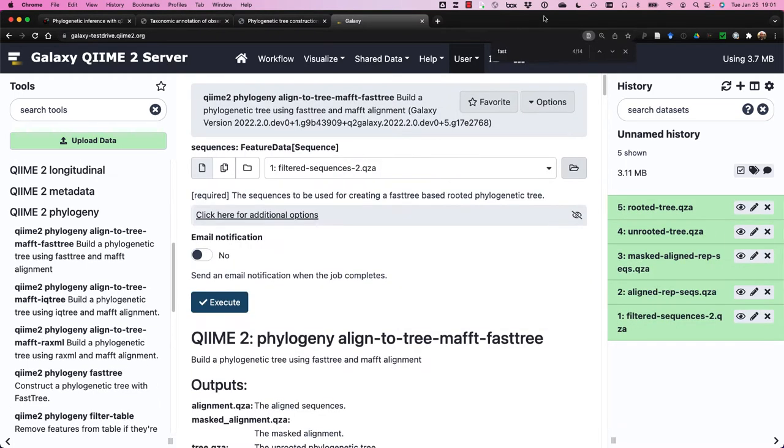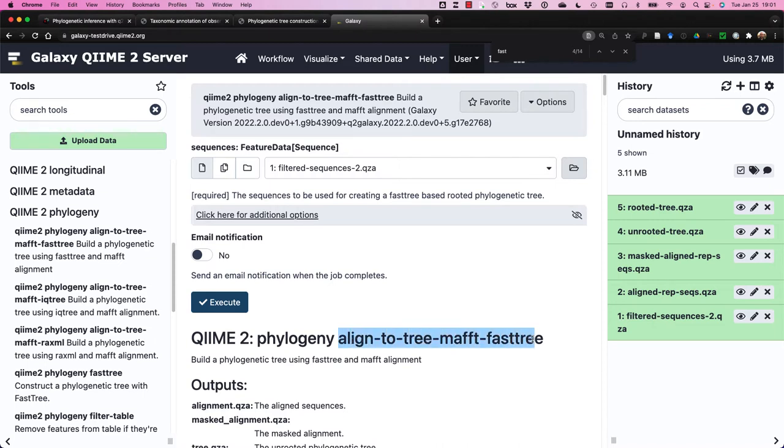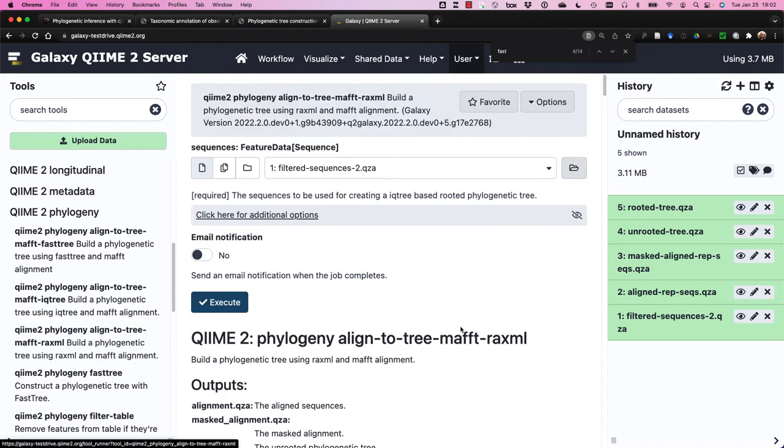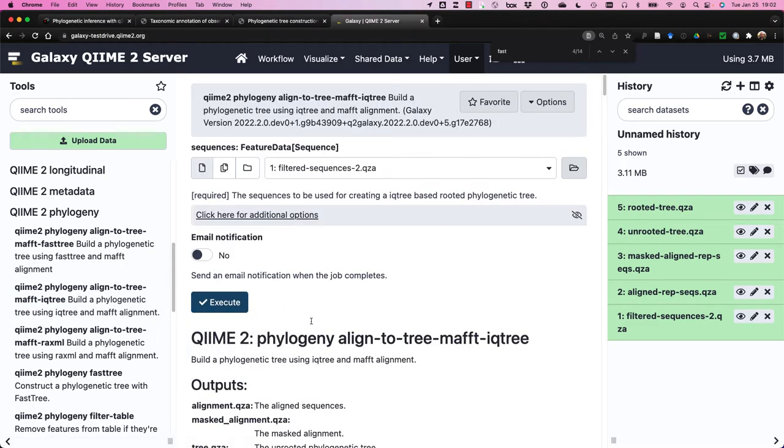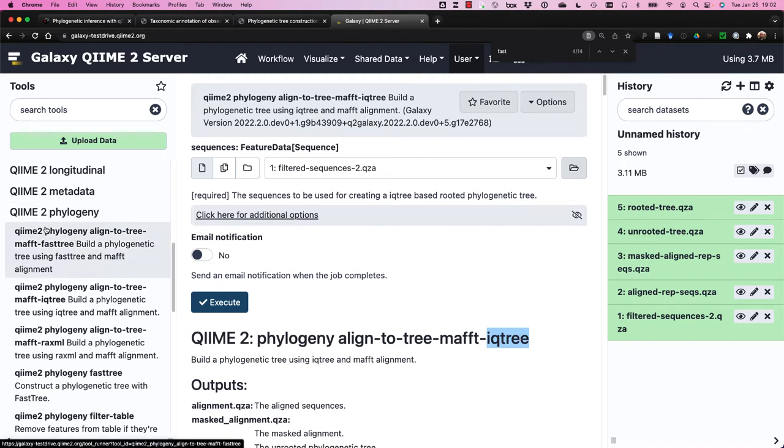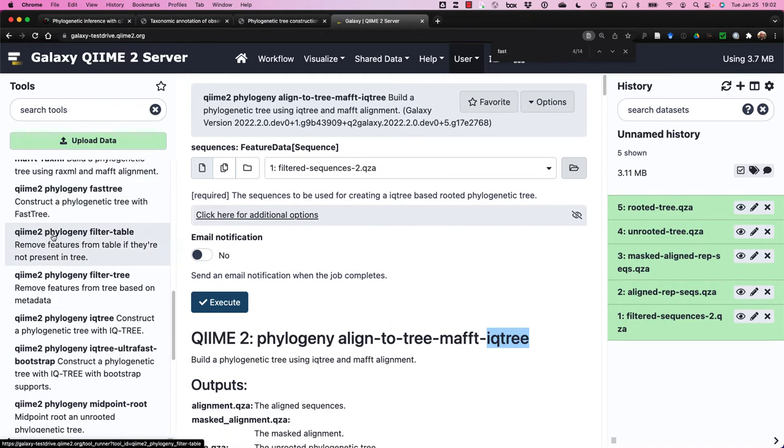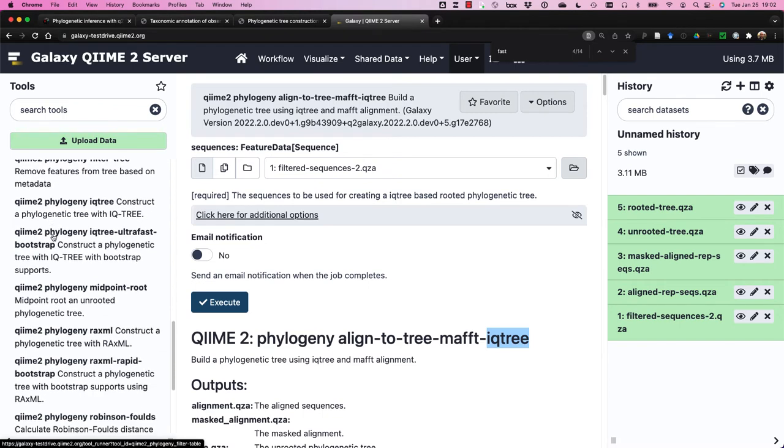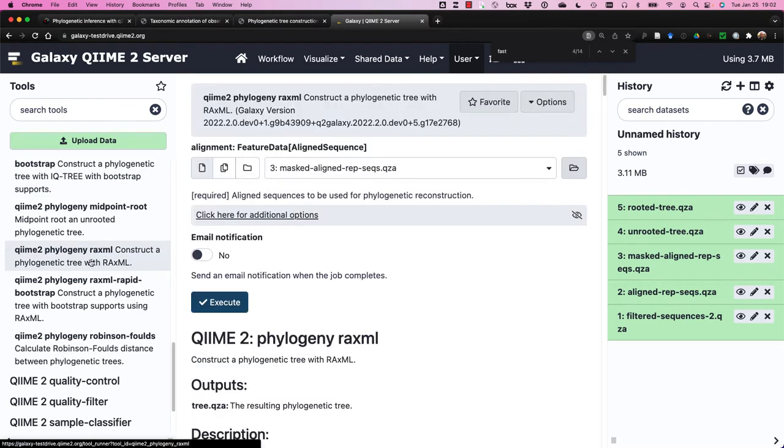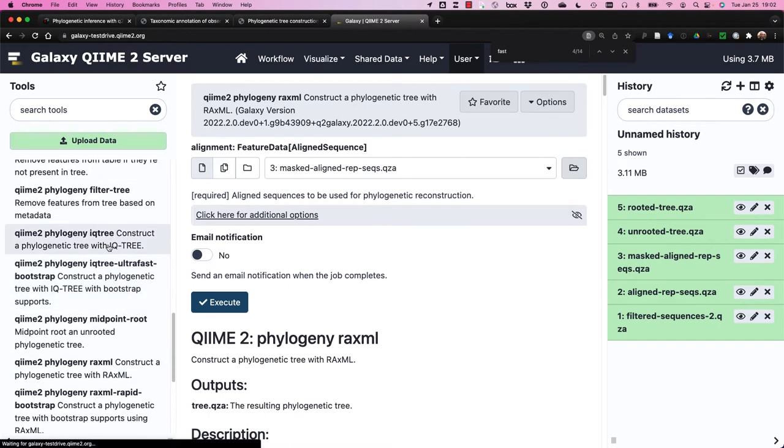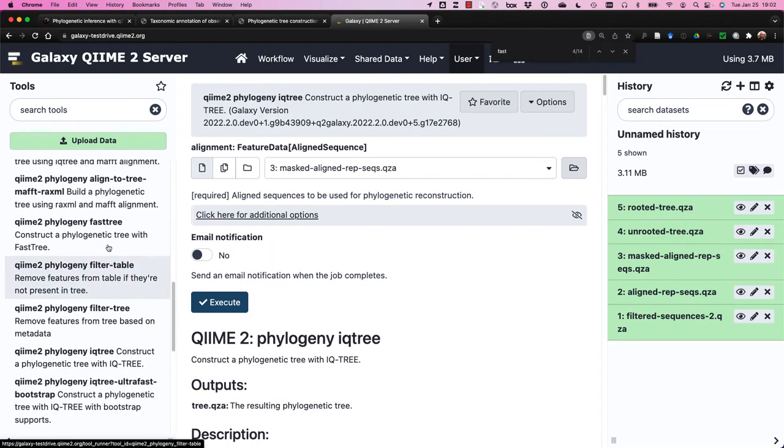Before we move on, I'd like to highlight a couple of the other pipelines available in QIIME2 Phylogeny. We just completed running AlignToTreeMafftFastTree. But we also have AlignToTreeMafftRAxML, in which case we use RAxML in place of FastTree to generate a tree. And finally, we have the other pipeline called AlignToTreeMafftIQTree, in which case IQTree is used instead of FastTree. You can also run several of these tools individually. Here's the RAxML plugin, and here is IQTree, and so on.